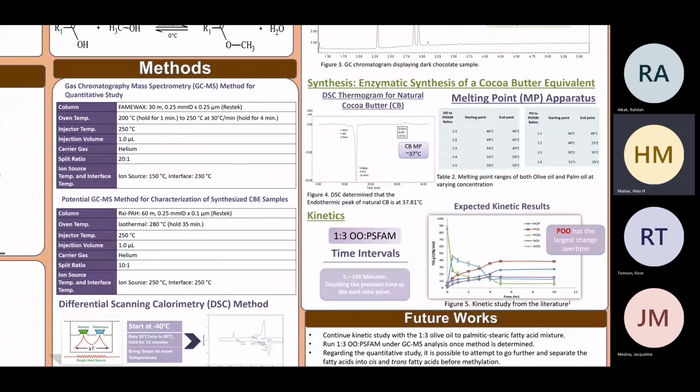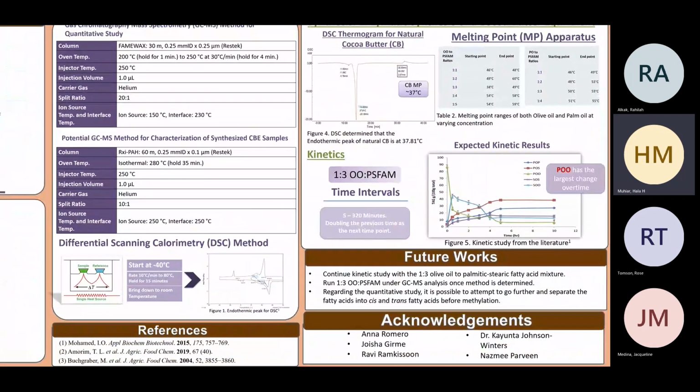Overall, continuing to future work, we still have yet to run our ratio on GCMS after each particular timestamp in order to get results for our kinetics, and as Hala mentioned, we still have yet to finalize a new method for our synthesis.